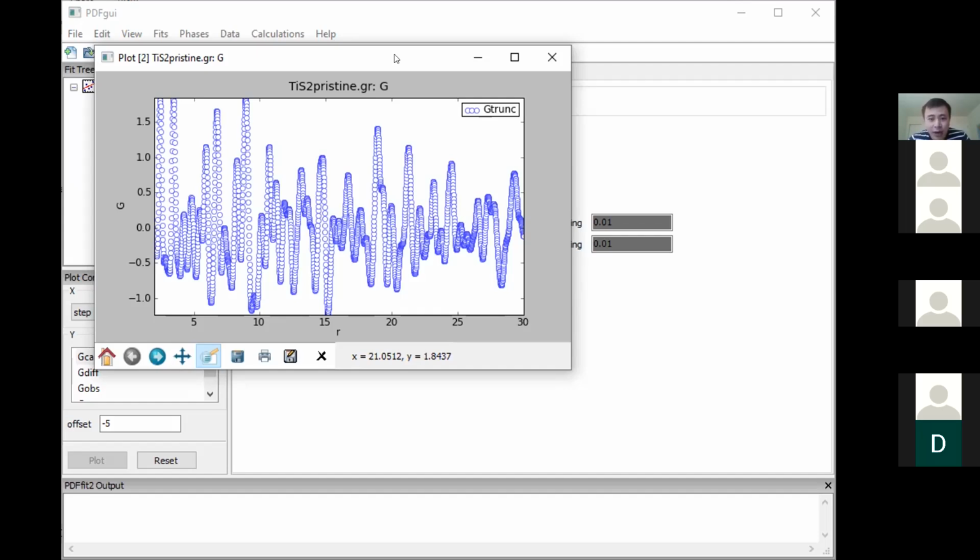And if you look at the diffraction data used for PDF, you will see that those peaks have a huge overlap. This is imaginable since you are placing your 2D detector so close to the sample. You want to get a high Q, but this is at the compromise of angle resolution. You will not be able to resolve the peaks.